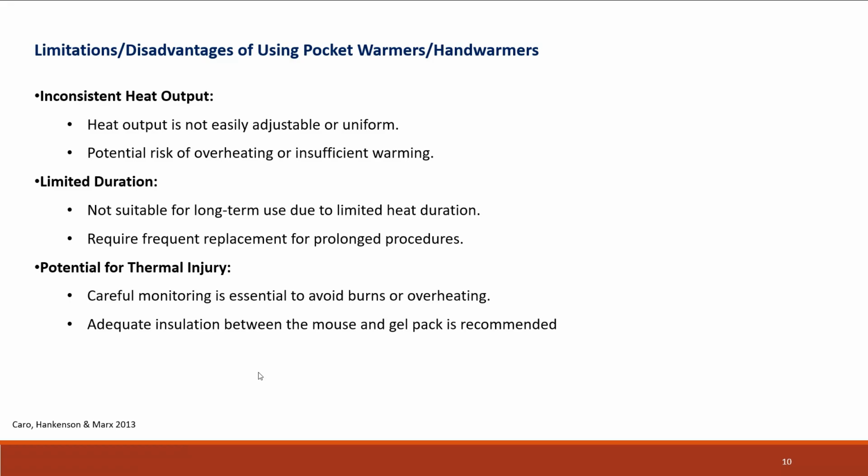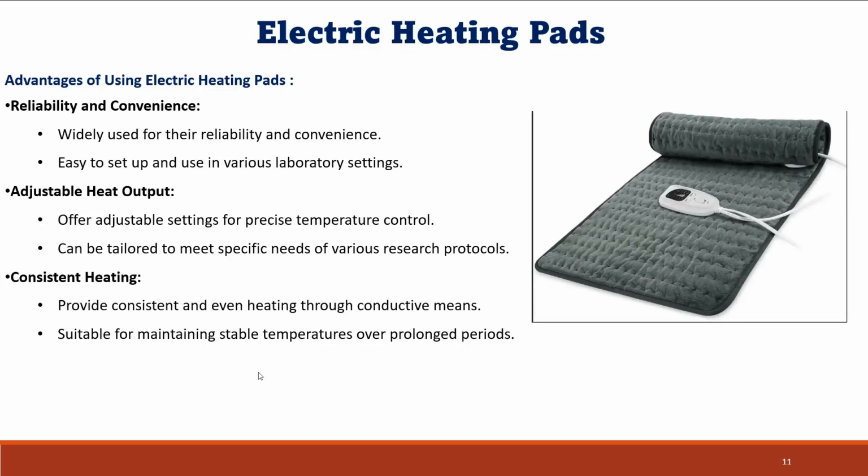Thus there will be no uniform heat output or warming of the animal. It surely cannot be used for long term because of limited heat duration, and if at all it is used for long term, you have to replace them. So, in that regard, careful monitoring is very important. Many of the research studies have also recommended, if at all you have to use them, make sure that there is adequate insulation between the animal and the pocket warmers or the gel warmers to prevent burning of the animal or any local burns. So, those are the disadvantages of pocket warmers.